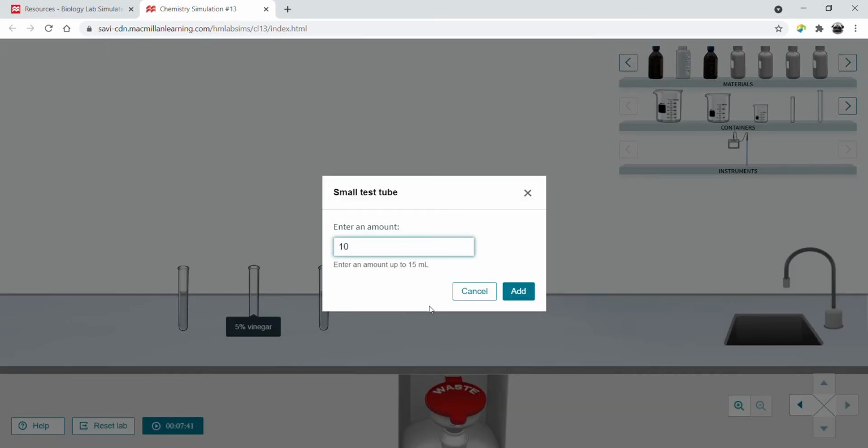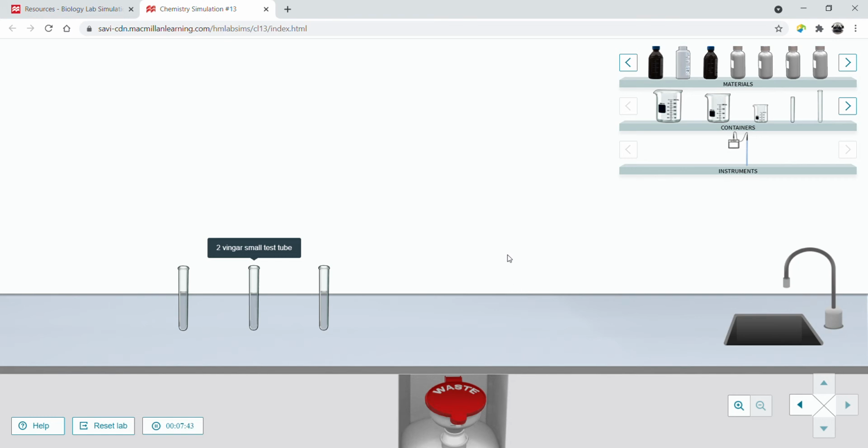10. Okay. Very good. Okay, here's our pH meter. So now record this in table 1. Okay, there's your pH. You want to record that in table 1. Got it? Okay. This is table 1. Here's the vinegar. There's your pH. Very good. And here is your ammonia. There's your pH. Okay. Well, let's put our pH meter back. We'll get it later because we will need it for another experiment.